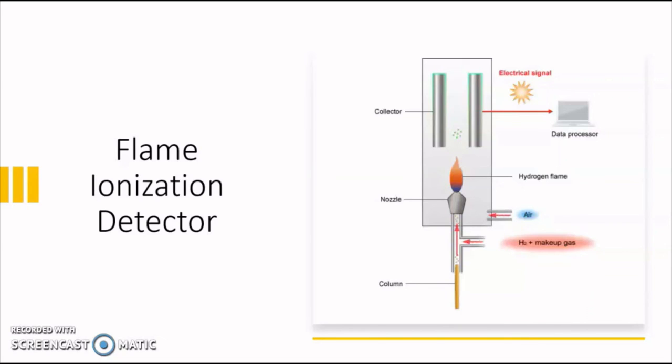Ethylene glycol has a chemical formula of C2H6O2. That means there are a total of 4 single carbon-hydrogen bonds per molecule that could potentially be detected by the FID as our sample burns. Keep in mind that only one molecule in 10,000 will release an electron to be captured by the detector.